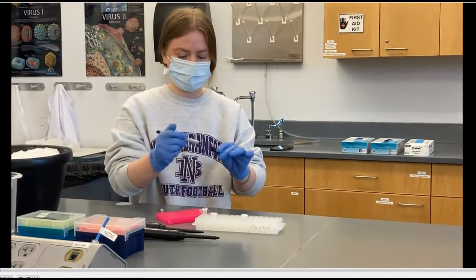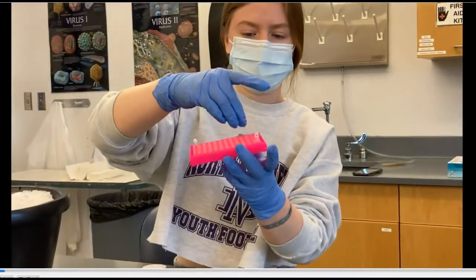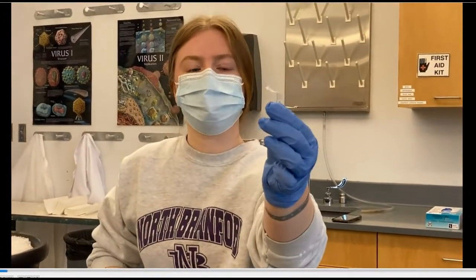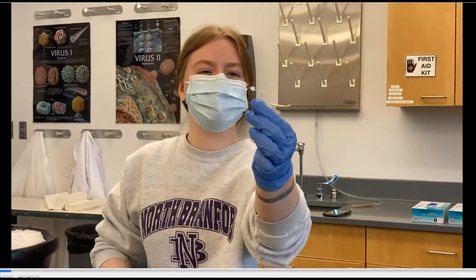Can you hold up the little tiny PCR tubes so that people can see how tiny they are? These are really tiny and also really easy to break, and they get static-y and stick to your gloves, so they can be a little troublesome to work with.